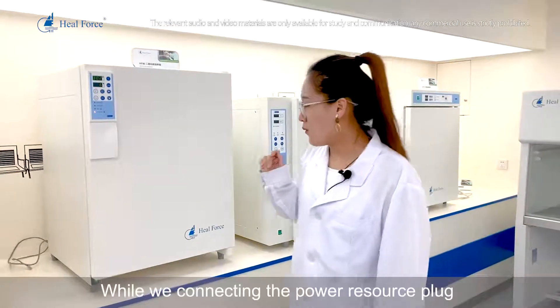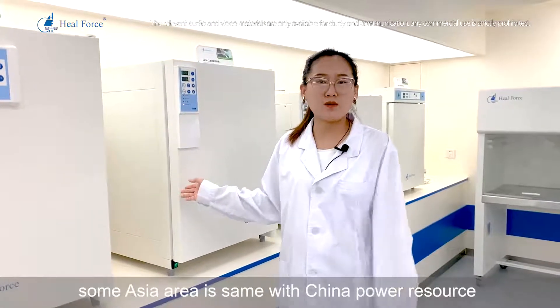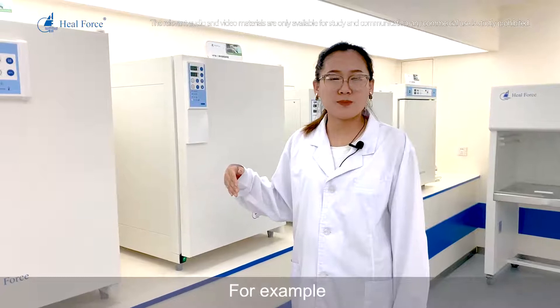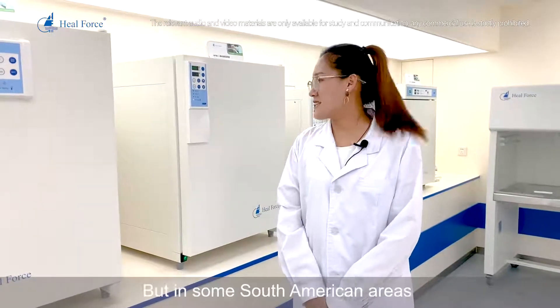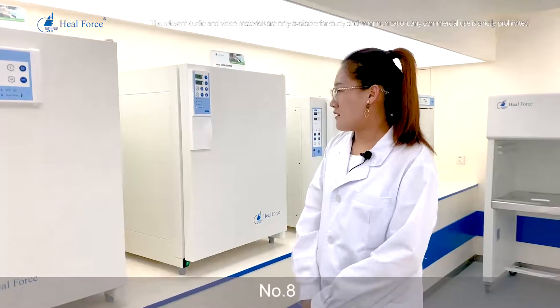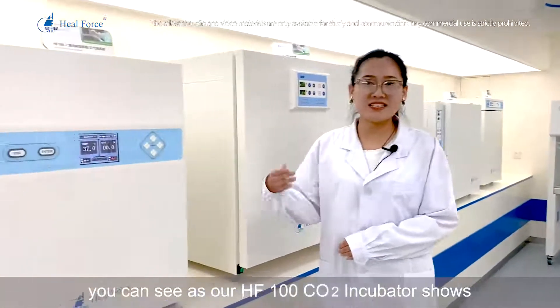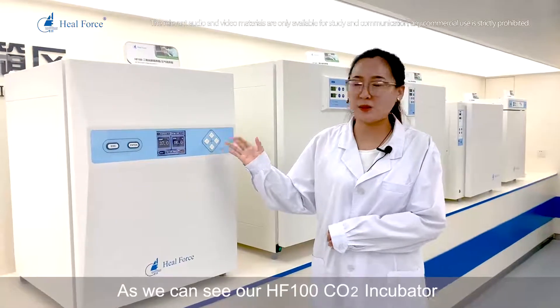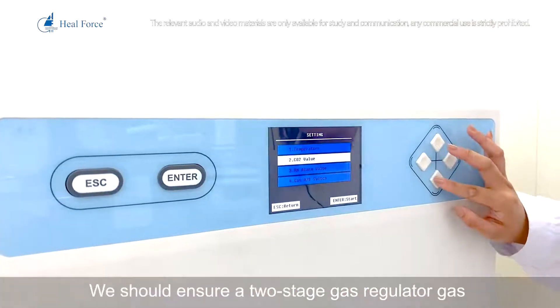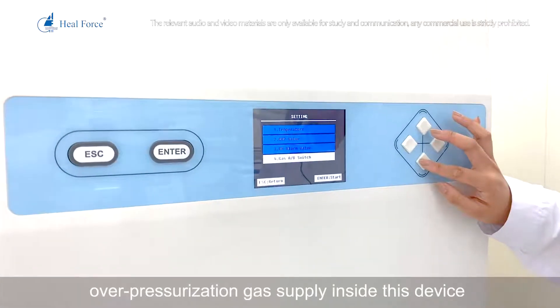Number 7: when connecting the power supply, ensure the correct voltage. In some Asian areas the voltage is the same as China's, but in some South American areas it is different — for example, China uses 220V while some South American areas use 110V, so be careful. Number 8: when connecting the gas port, ensure a two-stage gas pressure regulator is connected to the device to avoid over-pressurization of the gas supply inside the device.